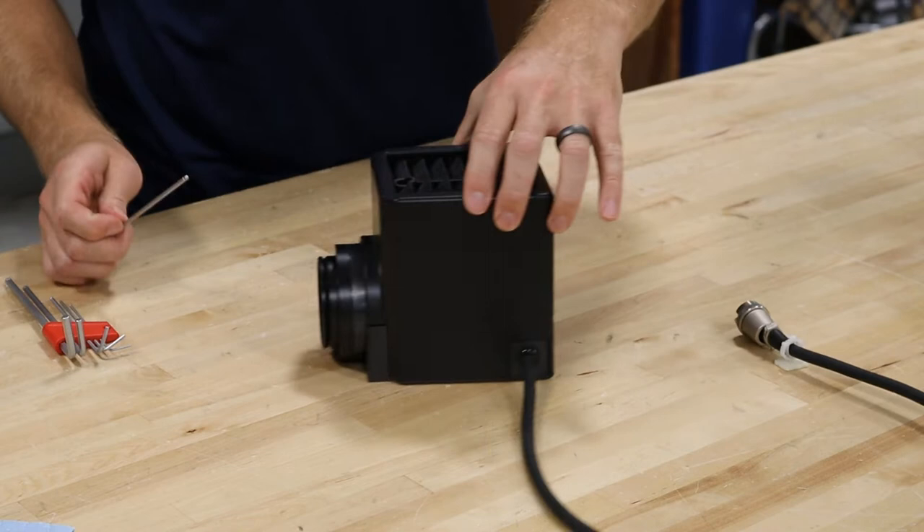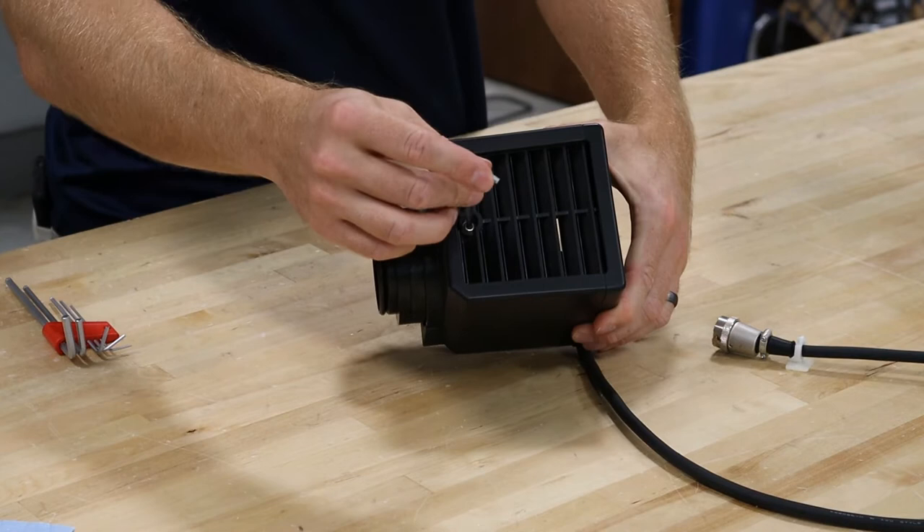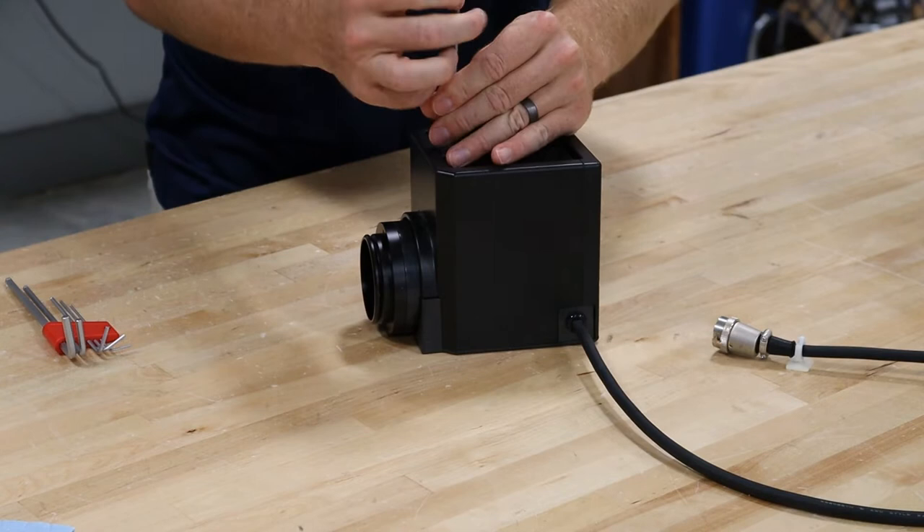So on this lamp house, you put your three millimeter Allen wrench right here in the top and then rotate it. And then this cover will come off.